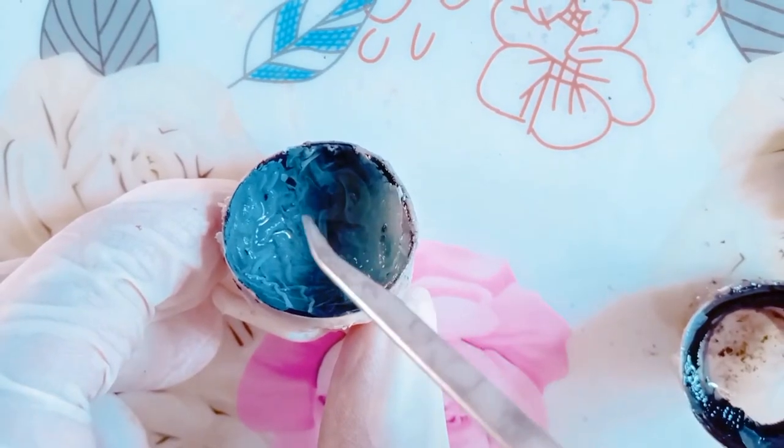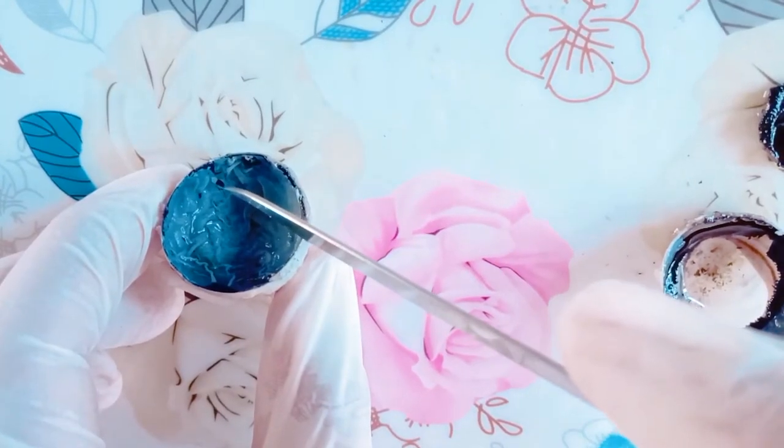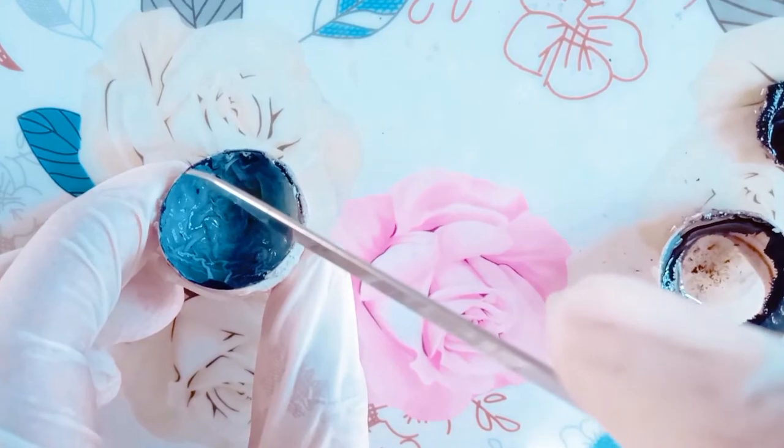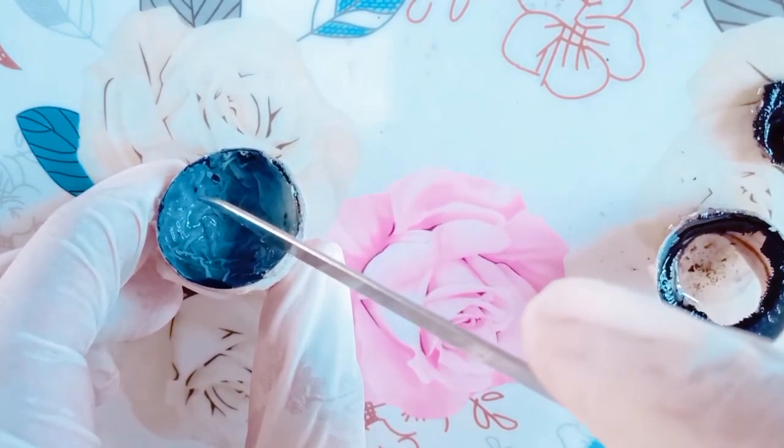This is the innermost layer of the eyeball, called the retina. This is the optic nerve. It is connected to the retina. The image of the object is formed on the retina, and that image is carried to the brain by the optic nerve.